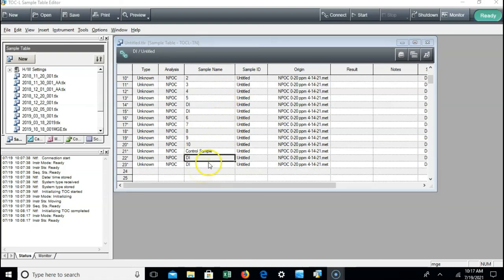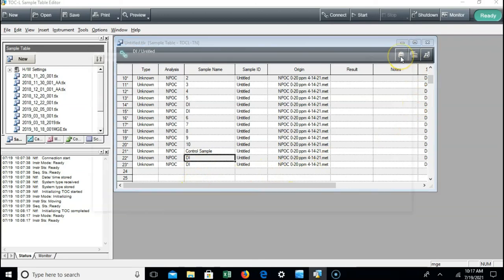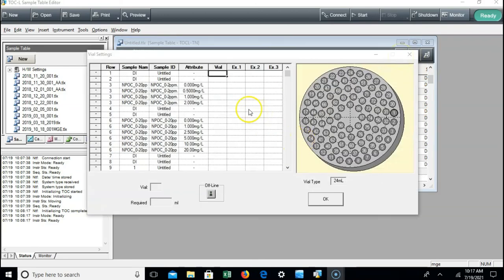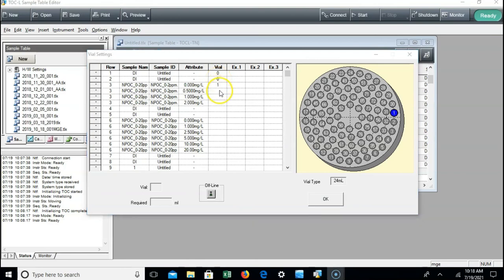Once you've got the order of your sample set up, we need to update their locations in the tray. Click on this button that looks like a cake and tell it where your samples are. This column is where you input all of your sample locations. Remember DI water is always vial zero, and each of your calibration points needs to come from a different vial. Go through each one and input the position that matches where you placed them in the actual sample tray.